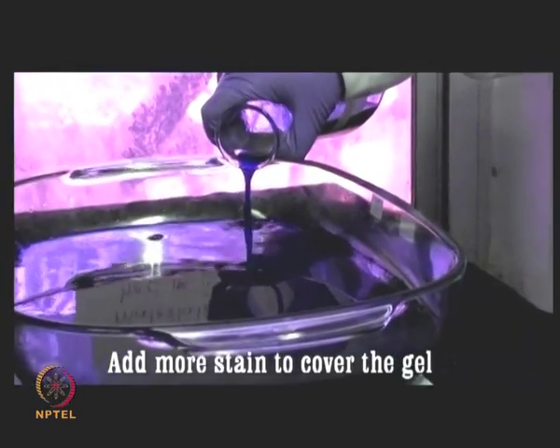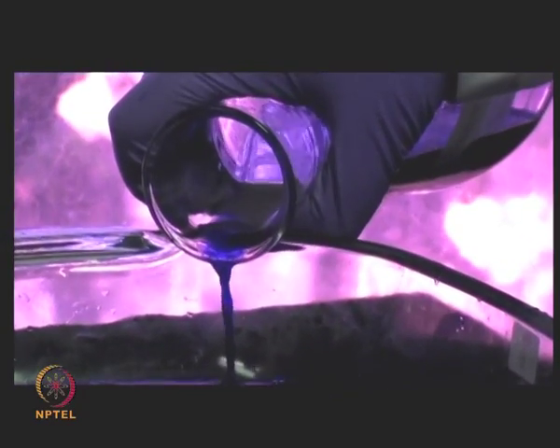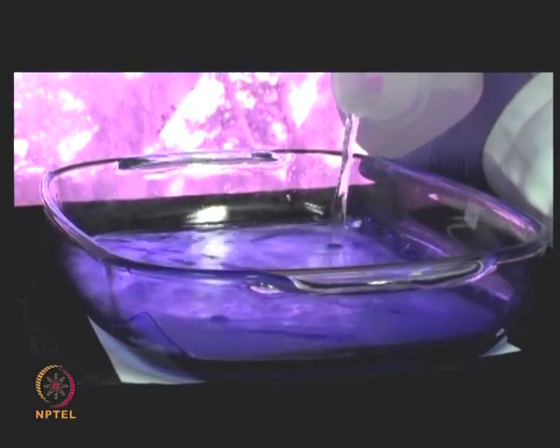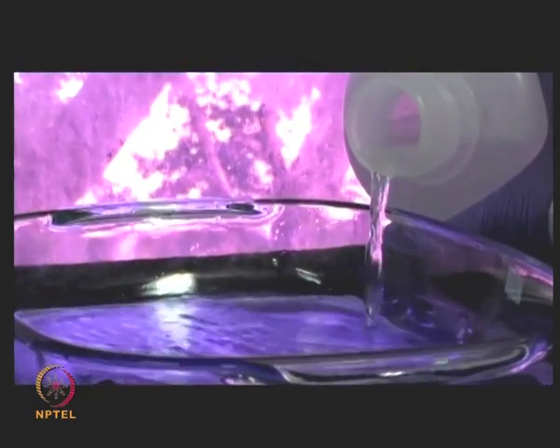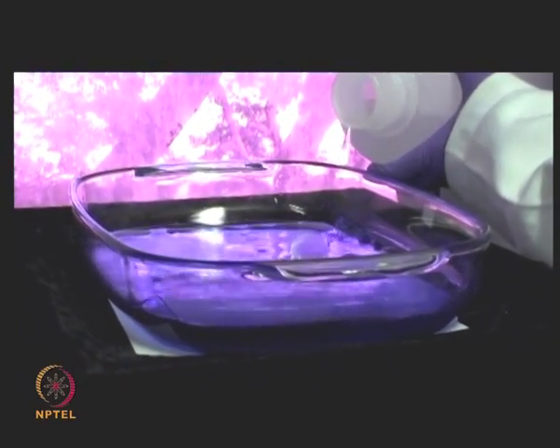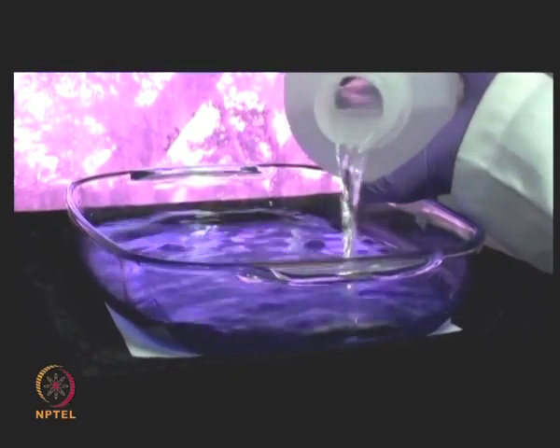Add some more staining solution such that the gel is completely immersed and leave it overnight for around 8 to 10 hours. Destaining. Drain out the staining solution from the tray and pour the destaining solution consisting of methanol and acetic acid into the tray. Place the tray on the shaker for around 6 to 8 hours until the background stain of the gel is completely removed and the spots are clearly visible.